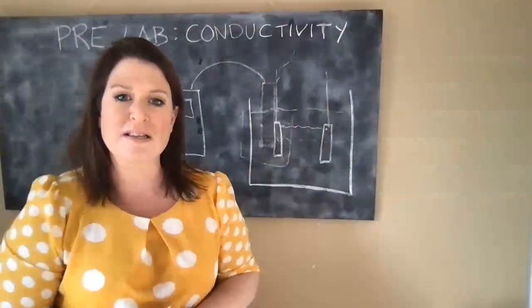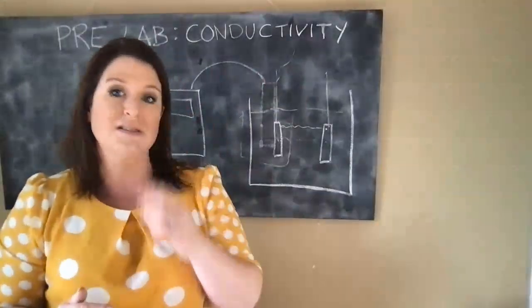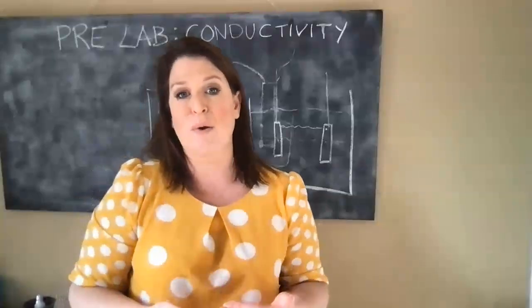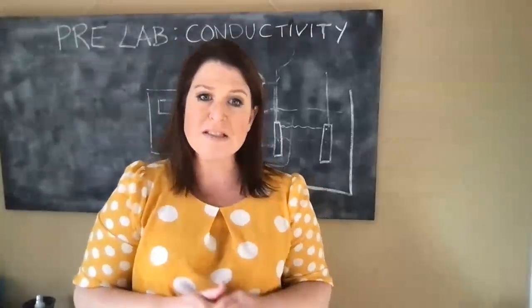So that's the first part of the experiment, recognizing that the nature of the ions and the concentration of ions in solution impact conductivity, and looking at the trends that we're going to see in that. So we'll discuss this more in the pre-lab talk. And that's the first section.